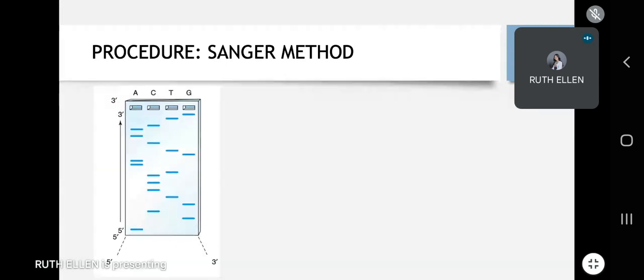Okay? So, example. So, in this case, meron tayong band present for adenine. State yung mga nucleotides present natin. So, start tayo sa 5' end. Okay? So, 5', meron tayong band present for adenine. Ano yung nucleotide present?